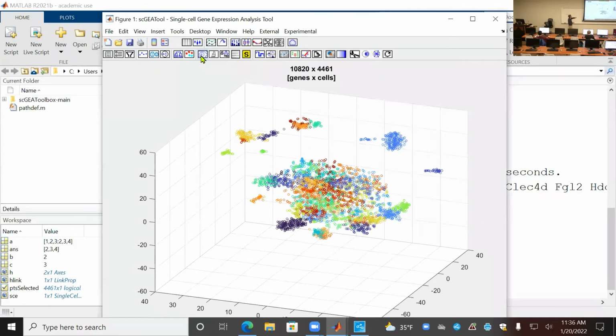Okay, and then the next one is to click that button I'm just pointing to. That's automatic annotation of cell type. Now you just wait. Okay, it will annotate all the small clusters. The sample is from a mouse, so make sure you select the correct species.